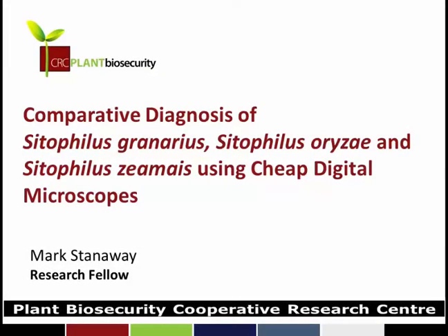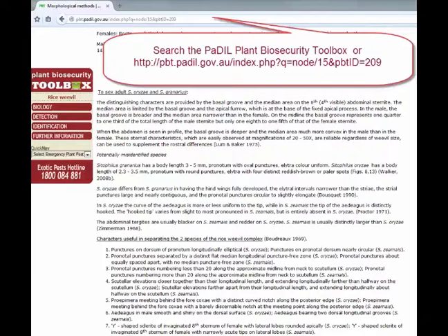Hi, Mark here. Today we're going to look at the diagnosis of the Sitophilus species found in grain storage areas in Australia: the Granarius, Oryzae, and Zeamais.